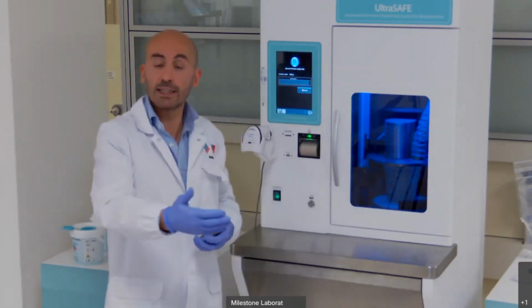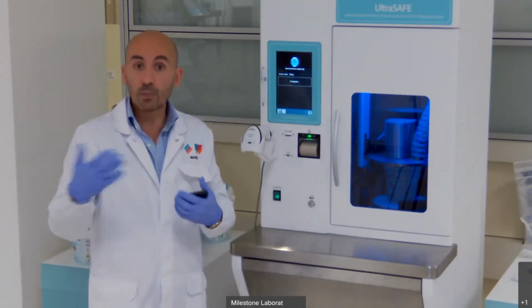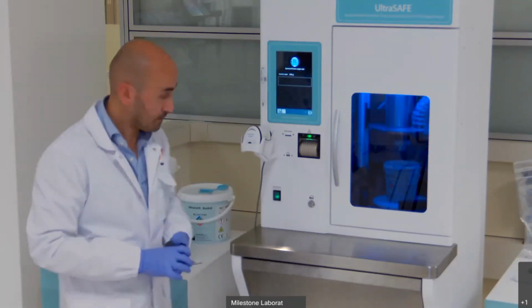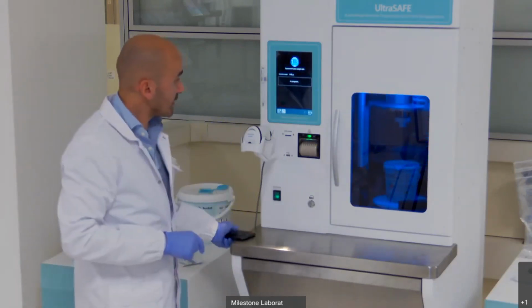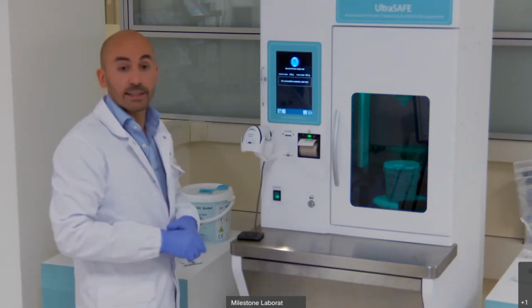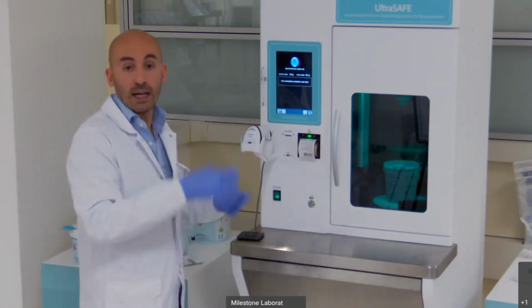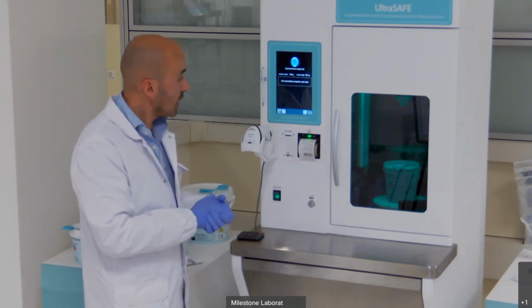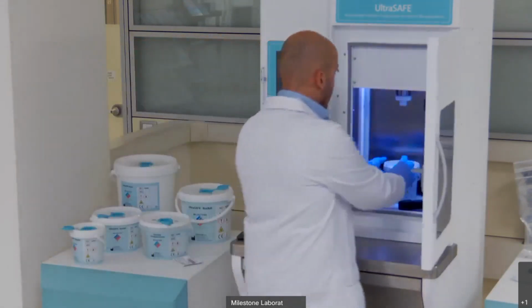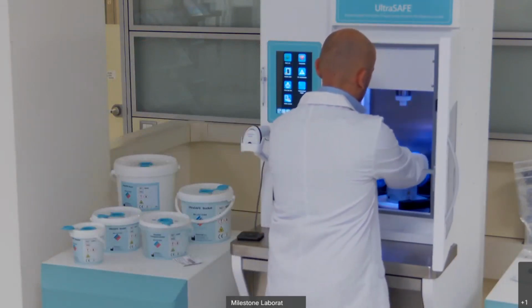So at the end of any procedure or at the end of the day you can start it automatically, and you have the possibility to disinfect the cavity with UV light. The procedure is now terminated, and I get a label with all the information. Before attaching this information to the bucket, the user simply needs to take out, to close the bucket inside the cavity.